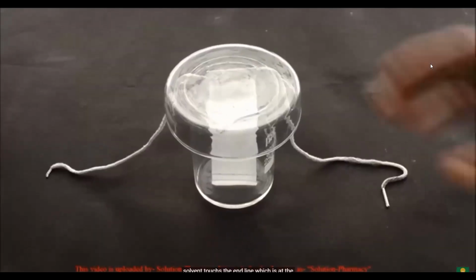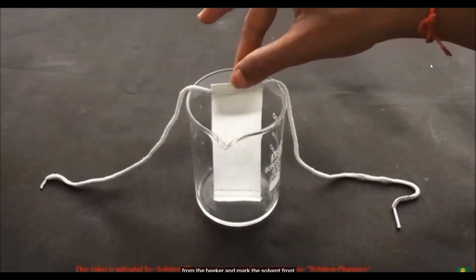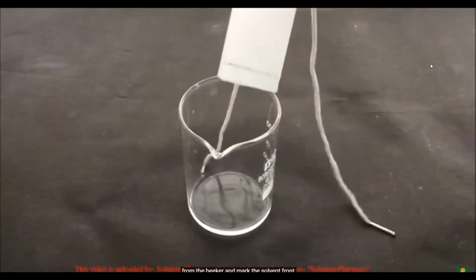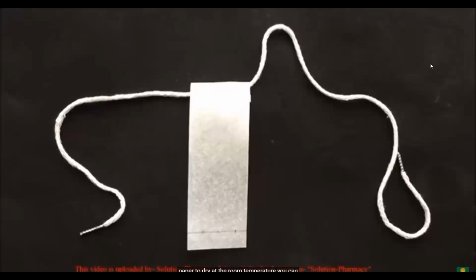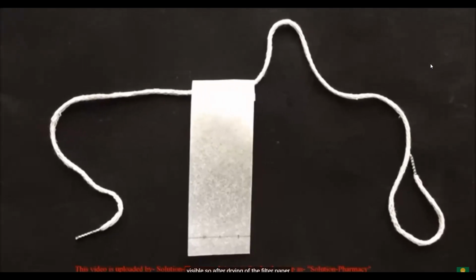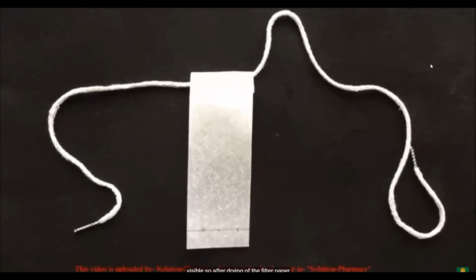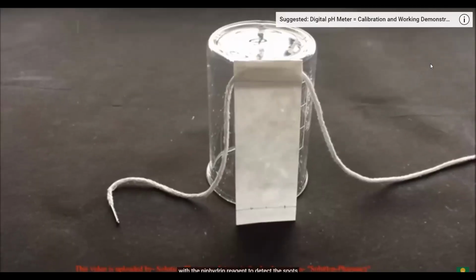When the solvent touches the end line, which is at the top of the filter paper, take out the paper from the beaker and mark the solvent front with a pencil, and then allow the filter paper to dry at room temperature. You can see that the spots of amino acids are not visible. So after drying the filter paper at room temperature, spray it with ninhydrin reagent to detect the spots of amino acids.